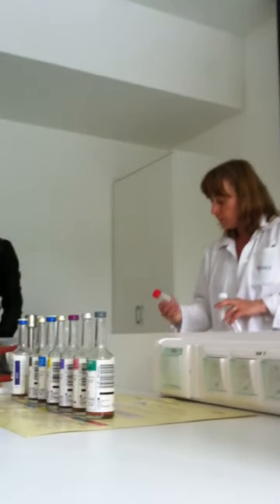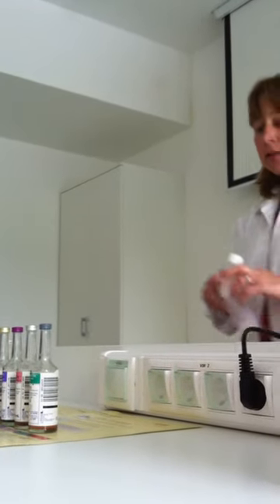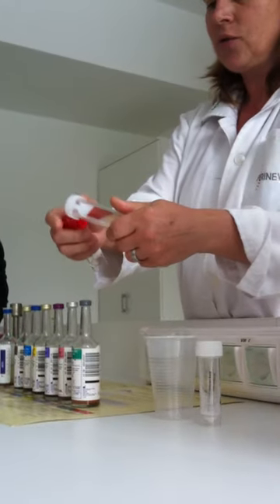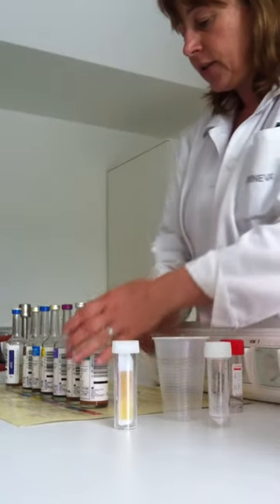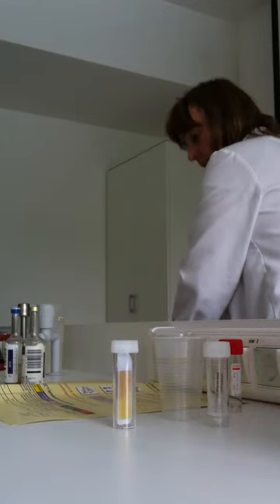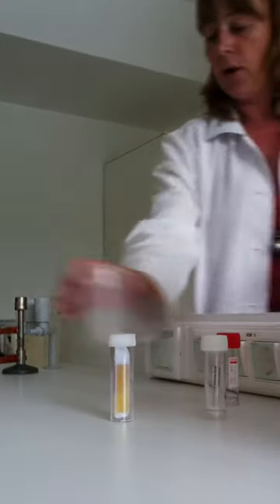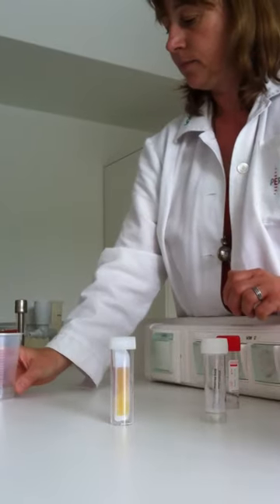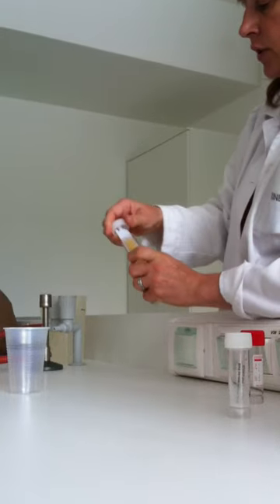The urine could be native or so-called Uricult. In this university, this Uricult is very useful. This is a dip slide. The appropriate technique is, if you have a urine sample, for example, here you are, the urine sample, and the staff should do this, not the patient.